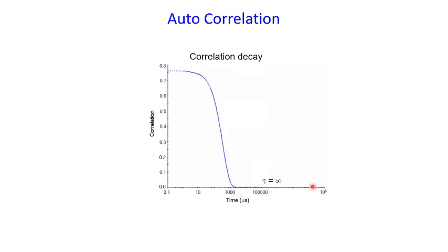Okay. And one thing that you should note over here is that the time infinity is not really a very large time, because here we are talking about time intervals in microseconds or even nanoseconds. So a couple of seconds can be considered as the time infinity in this particular time scale that we use for doing DLS experiments. So this is the correlation function, which is the essence of this analysis that will ultimately lead us to the particle size which we are looking for.